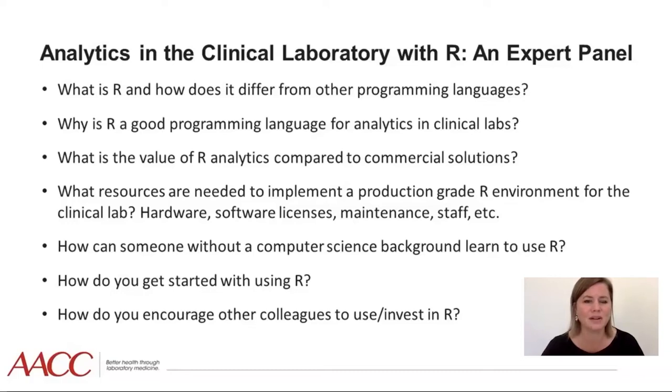So let's start off our discussion. Dr. Holmes, why don't you tell us what is R? So R is what we call a scripting language. It's a programming language, but it requires you to install R, the R interpreter, on your computer. So what you can't do is make an app for a Mac or a phone. There are certainly ways to accomplish those things, but you write your code and you have the R interpreter on your computer, and R will do the calculations that you request.